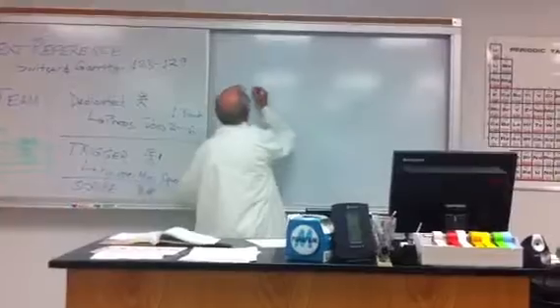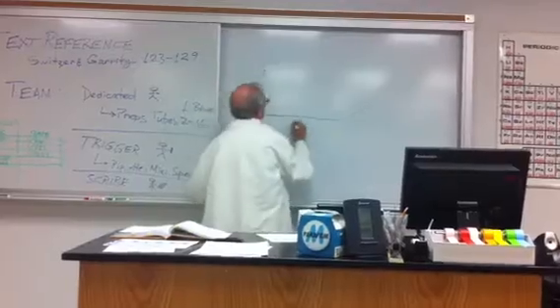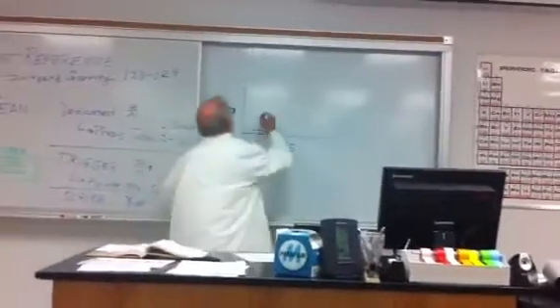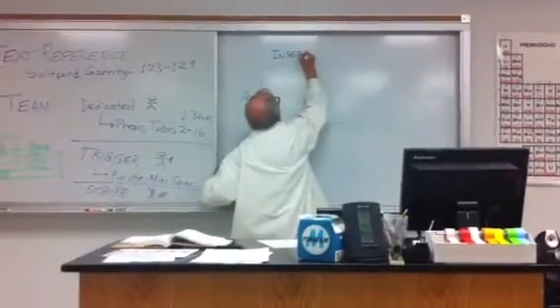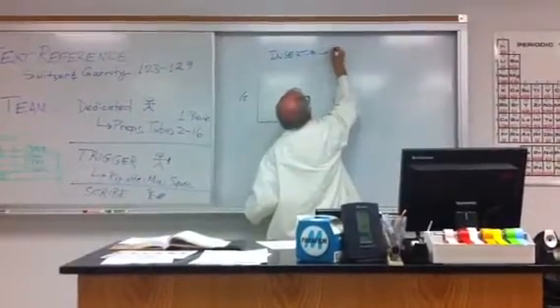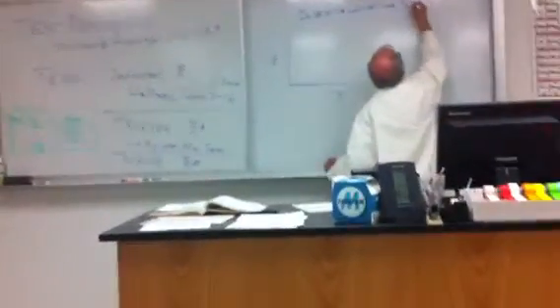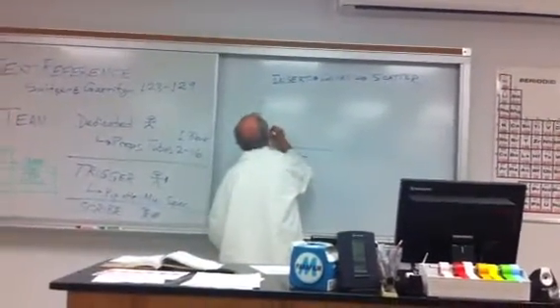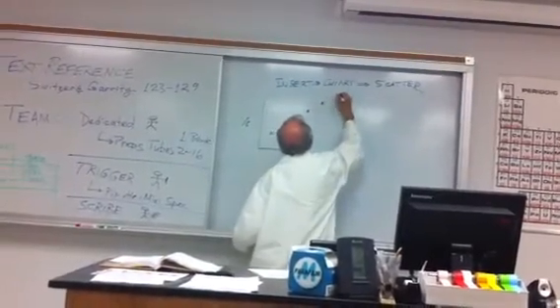What does that graph look like? It looks like this. It is 1 over V, 1 over S, right? Now watch out. This is done on, you say what, insert graph? I think insert. Chart. Graph? Chart. Thank you. You said chart. You go to scatter. And scatter will give you the following thing. You had 5.